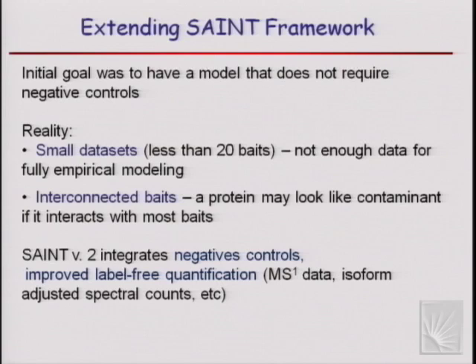So same point, version two that we are now working on does integrate negative controls, but not in a simple way of doing some t-test, looking at the counts in control versus counts in the experiment. Again, it combines the same modeling, but utilizes control as a part of this modeling. We're also looking carefully at MS1 data as well.